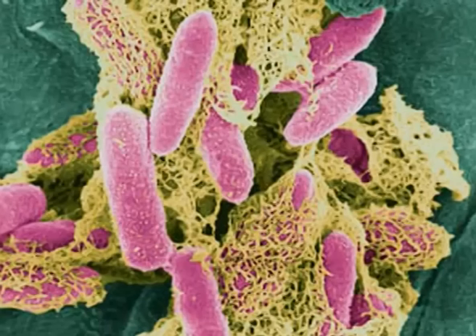How? The neutral red becomes deep pink in color in presence of acid. Thus, E. coli will produce deep pink colonies, while Enterobacter aerogenes will produce deep pink mucoid colonies. The nature of colonies changes from E. coli to Enterobacter, while the other group of bacteria like Proteus vulgaris and Salmonella typhimurium will simply grow on this medium without producing any color change. Why? Because they are unable to utilize the lactose.